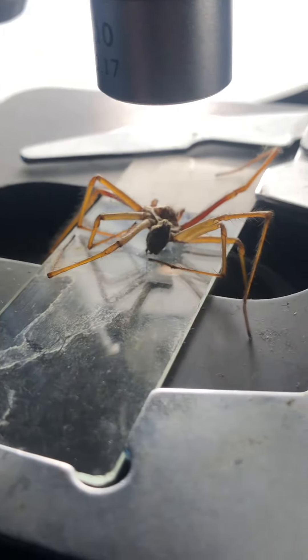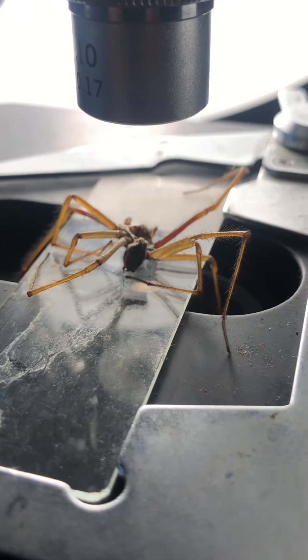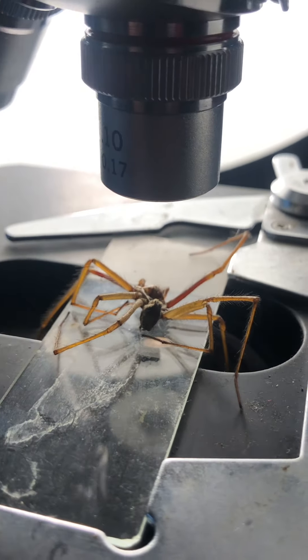There we go. Oh yeah, I've got them — the eyeballs. Is that the eyeballs? Yeah.